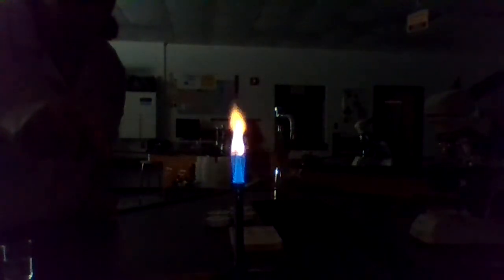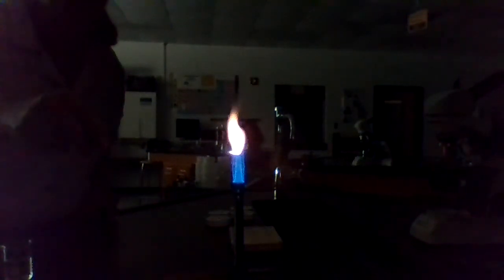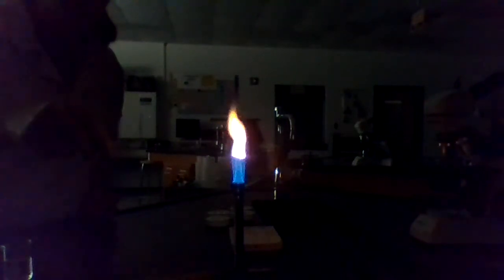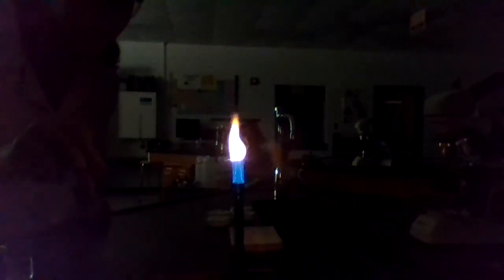Oh, it's like a white. Is that supposed to be like that? That's purple. It's like a lavender. Yep, do it again. I saw white. It's a light color, but it's purple. So give it a second. We're going to do it again. Purple, pinkish purple. Lavender is actually the color, but right on the edges is like a purple lavender color.